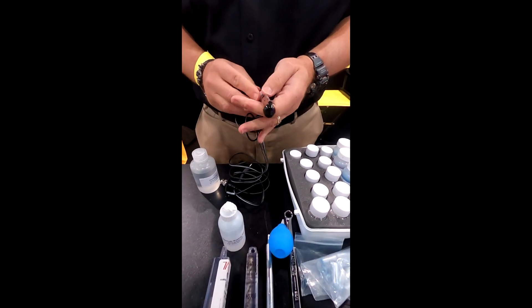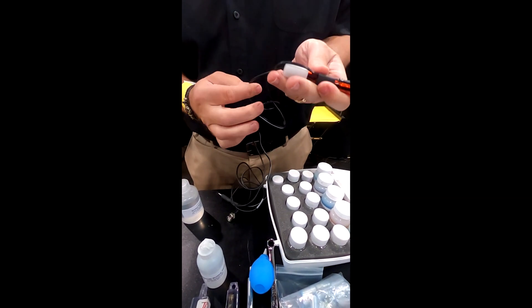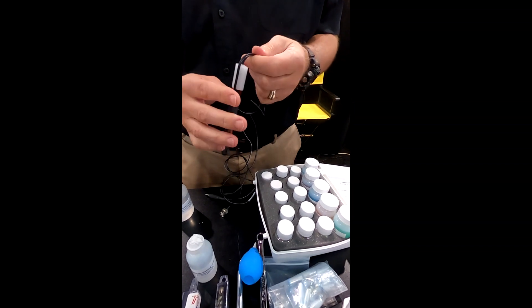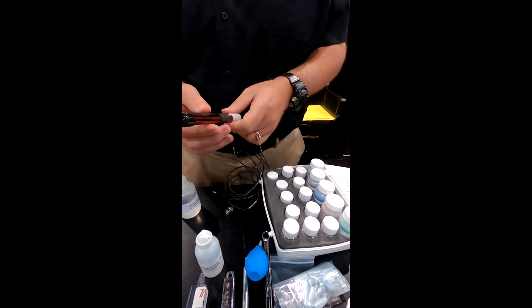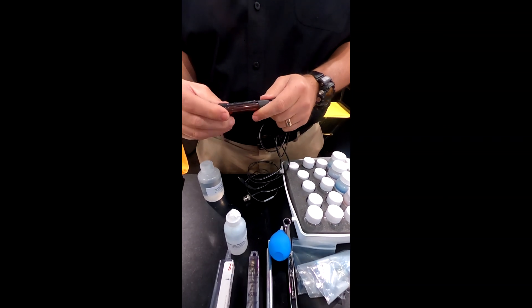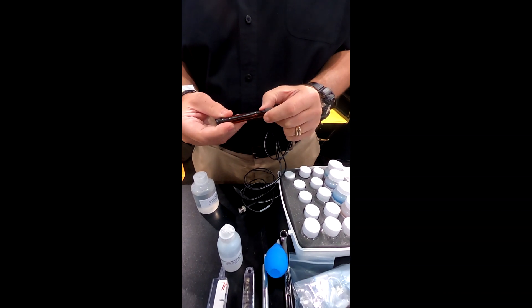This is the chloride ion-selective electrode. This cable is somewhat stiff and sensitive — don't cramp or mash this cable down tightly or you'll pretty much destroy the electrode. These are not cheap; they're about $1,000. So we don't want that to happen. First, you have to prep the electrode.